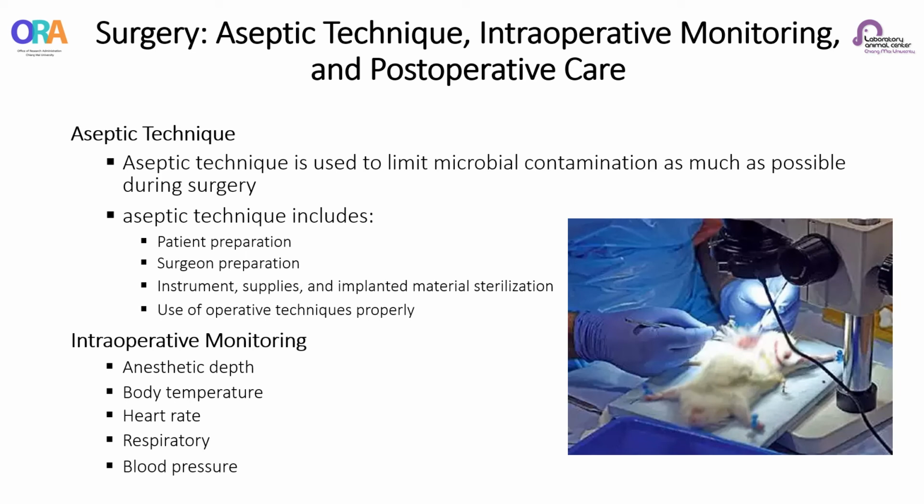Intraoperative monitoring includes routine evaluation and recording of anesthetic depth, body temperature, heart rate, respiratory rate and pattern, and blood pressure. And maintenance of blood pressure is important during surgery, as is body temperature maintenance, especially in small animals.